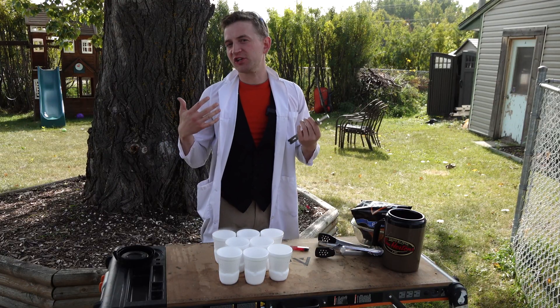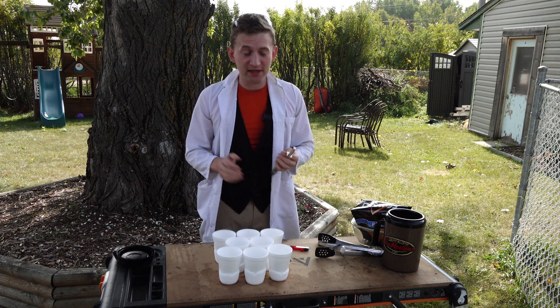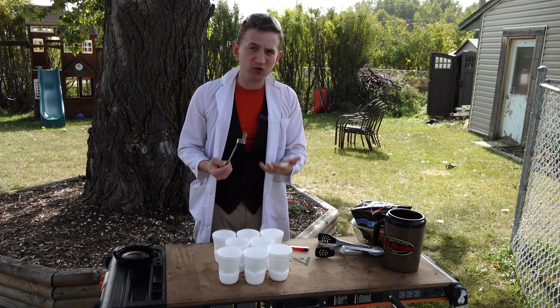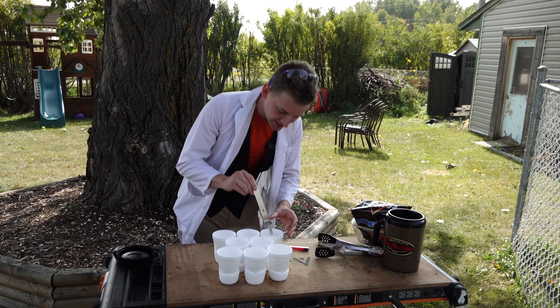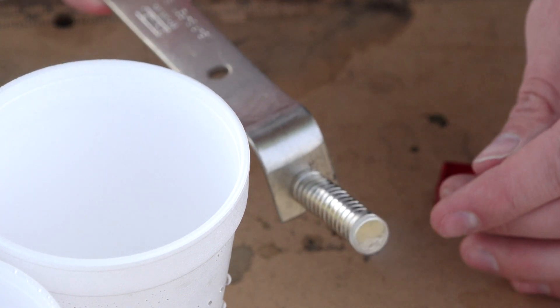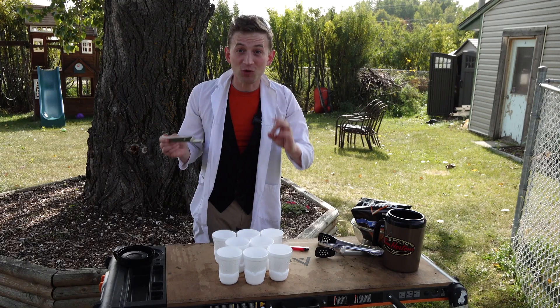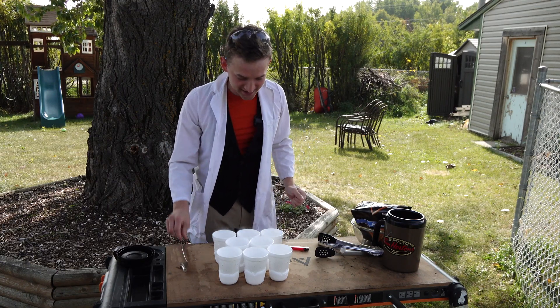As I said, liquid nitrogen is not magnetic. However, liquid oxygen is paramagnetic. So if I just take these super strong neodymium magnets and dip it in — that right there is liquid oxygen stuck to the magnet. So cool. It's working. That's great.